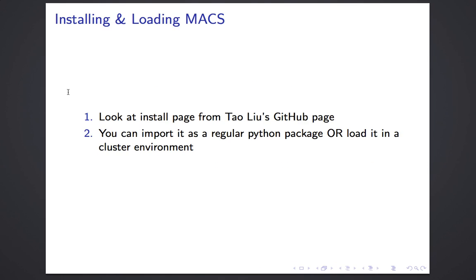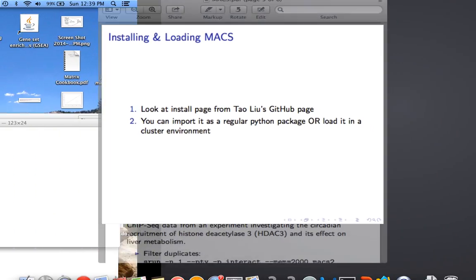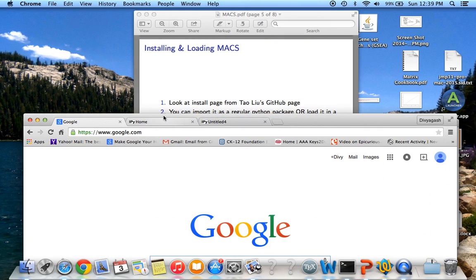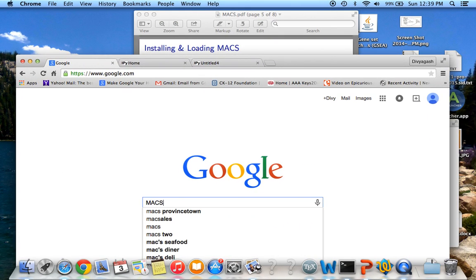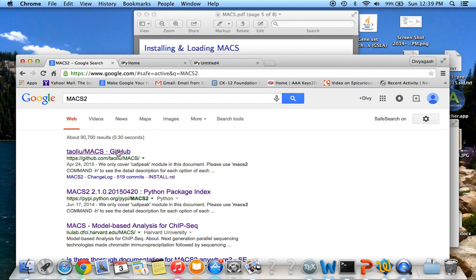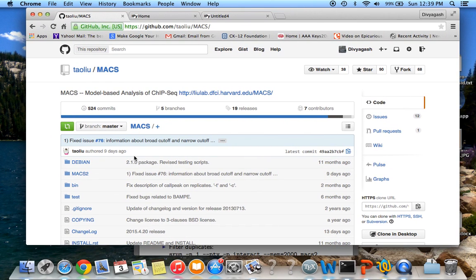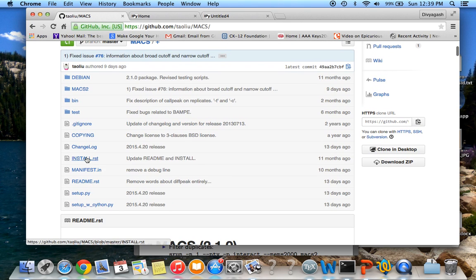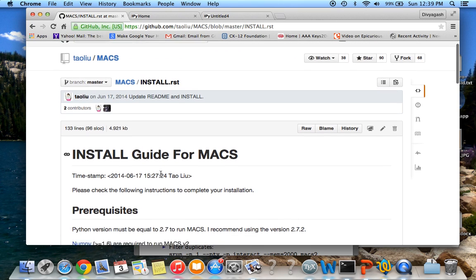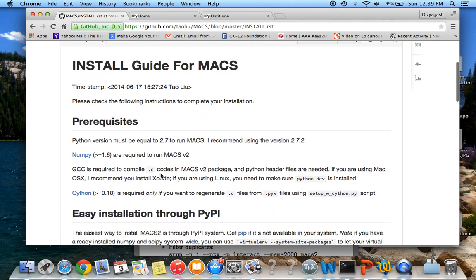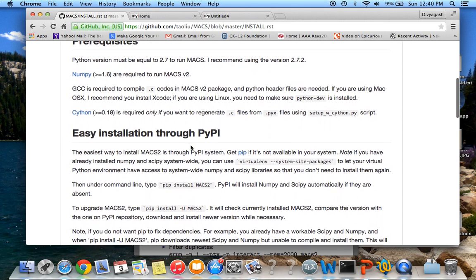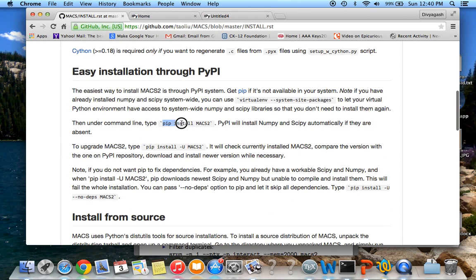To install and load the MACS package, first go to Google and type MACS2. The first hit is going to be Taoliu's GitHub page — he's the developer of this program. Go to install.rst, which has all the instructions on installing it. This is how to install it using the command: pip install MACS2.